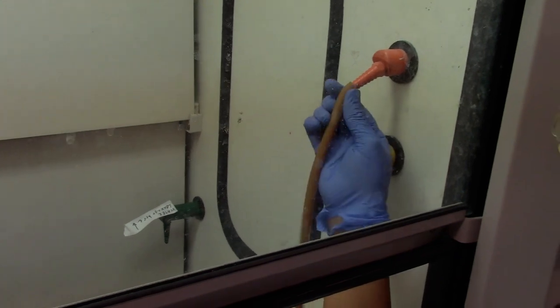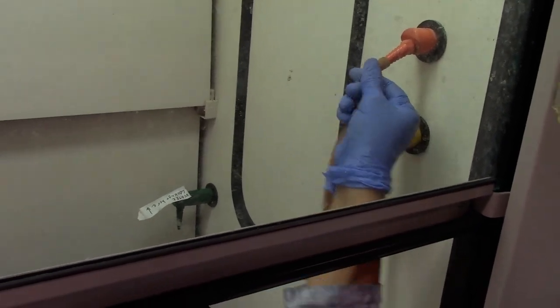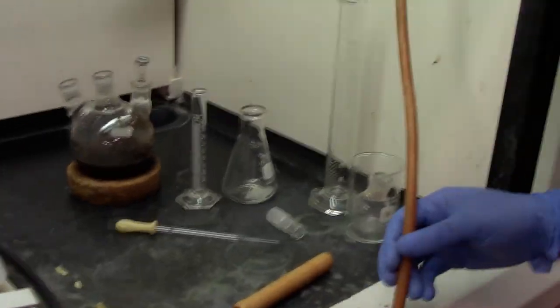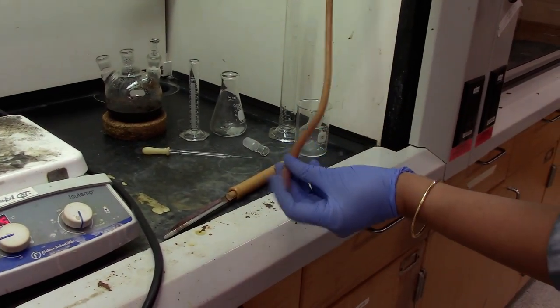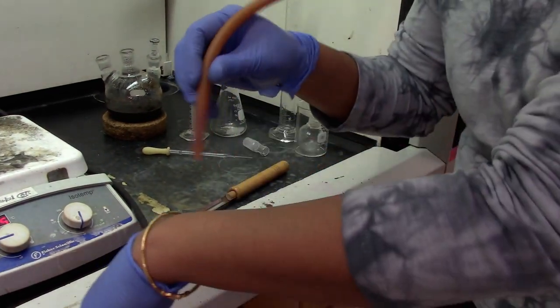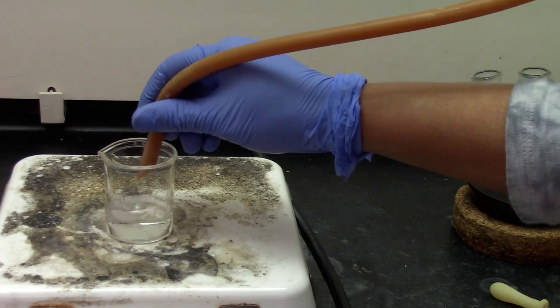Connect the Tigon tubing to the air connector, which is the orange one. Make sure the airflow is gentle. And gently blow air on top of the beaker.